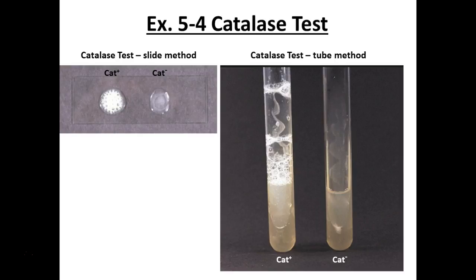I need to find at least two, because, you know, with that one test, you would figure out what organism you have. But some of our other tests are like that too. Takes the fun out of it.